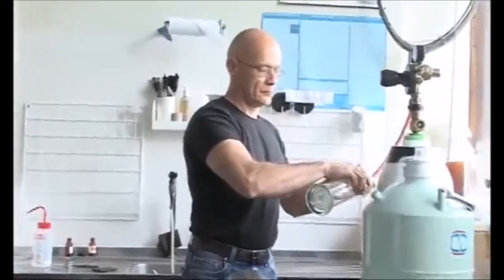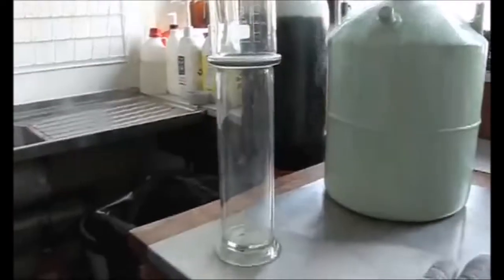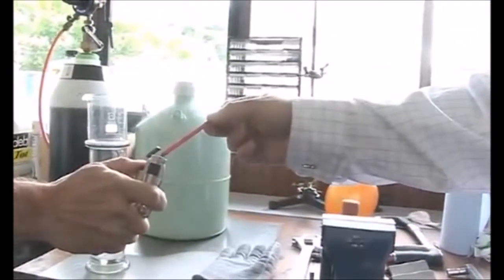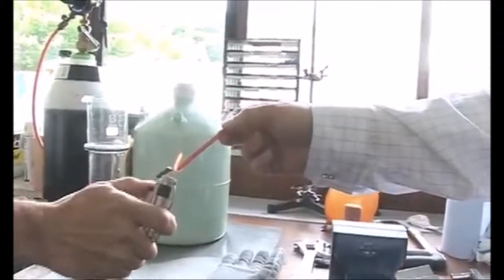So Neil's now connecting up a piece of tube to the oxygen cylinder, and he's going to fill up this gas jar with oxygen. And we're going to do a really classic experiment, the one that everyone learns at school to test for oxygen, which is to relight a glowing splint. So we have a traditional gas jar full of oxygen. So here you can see we're burning a splint. Okay, so this is the wood burning in excess oxygen around us.